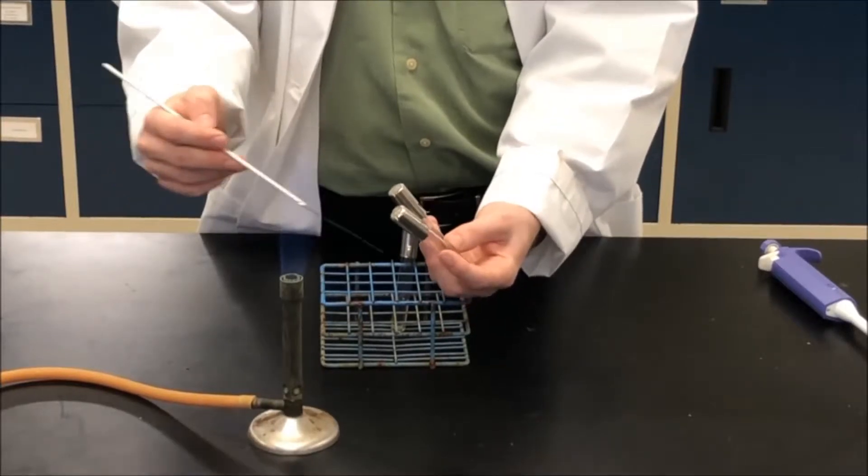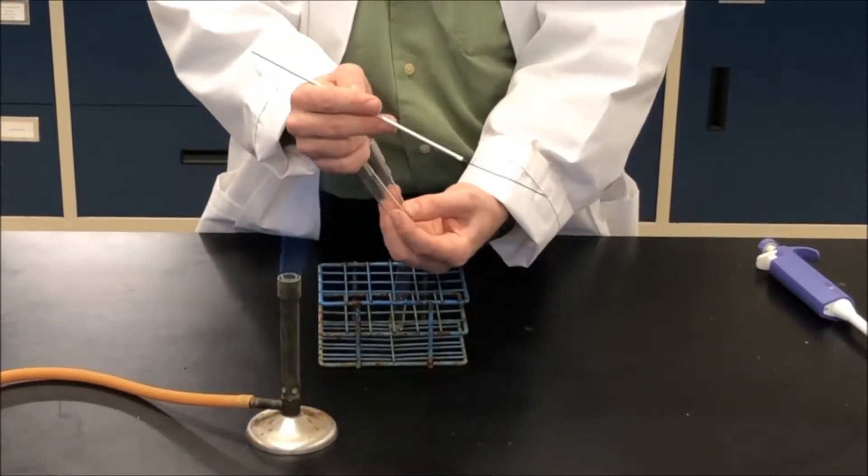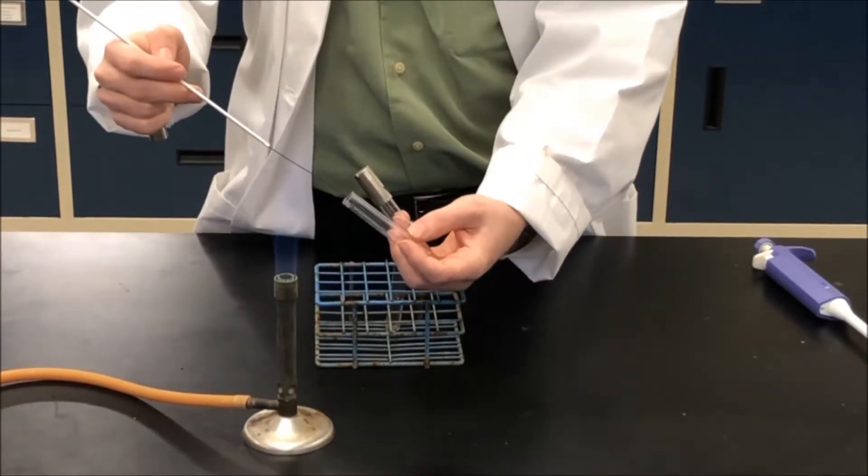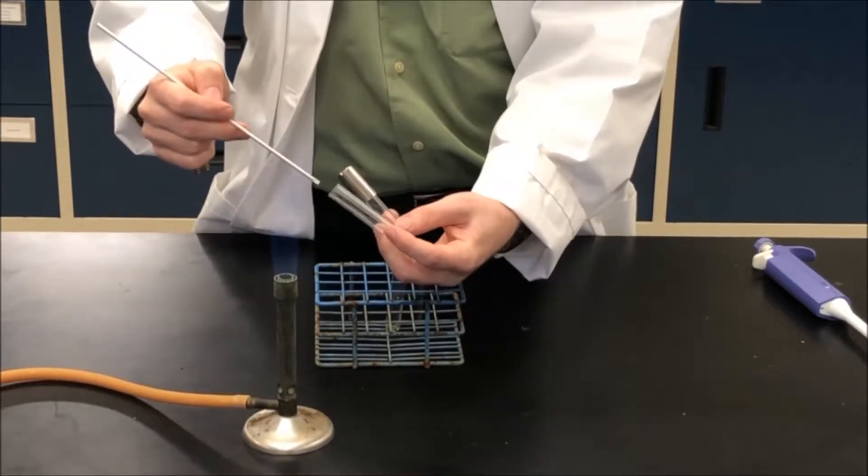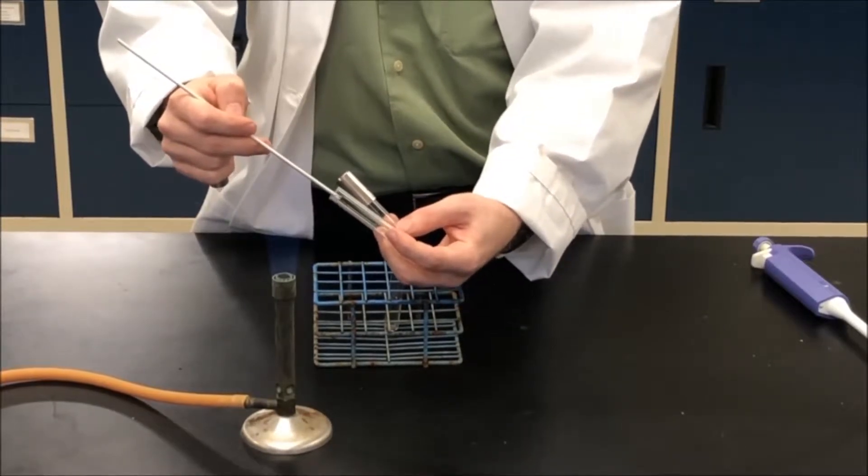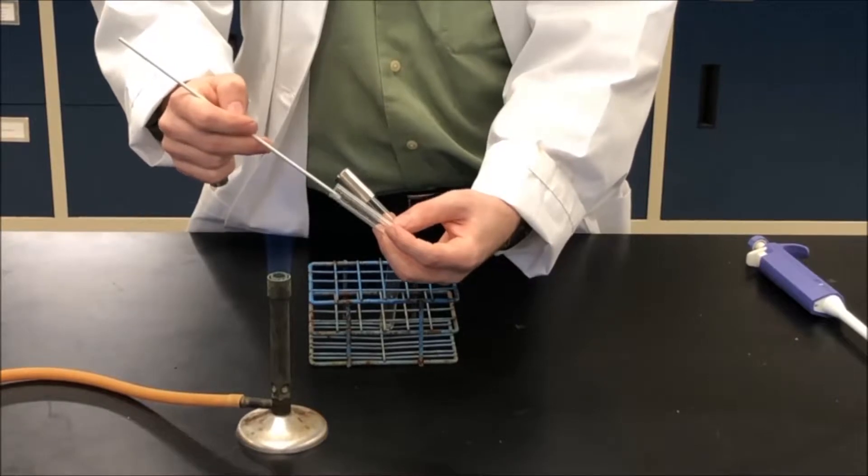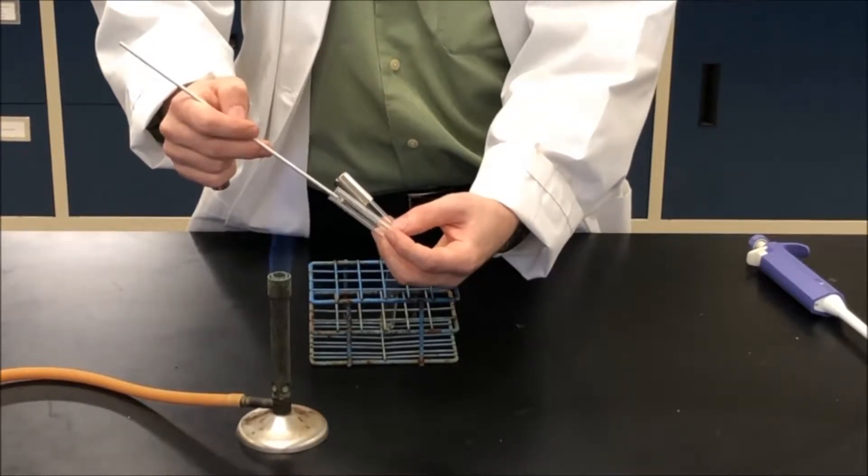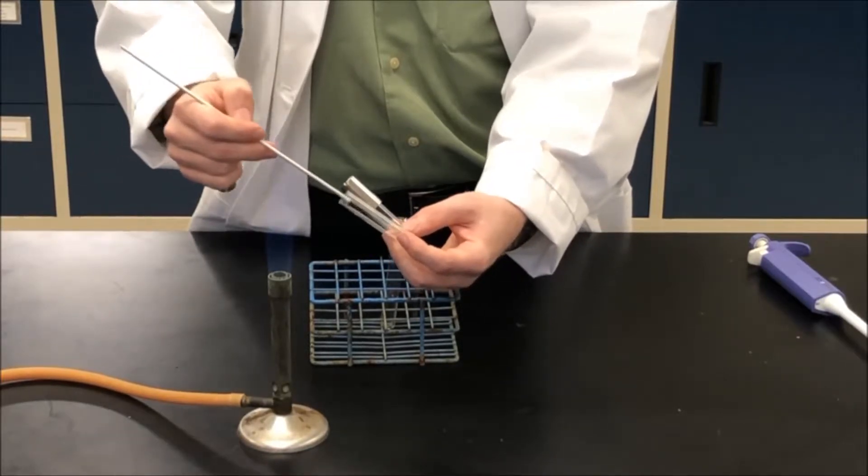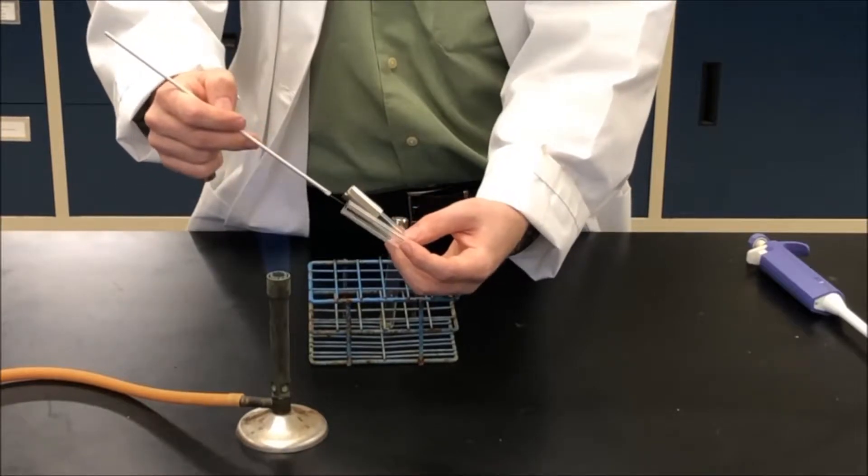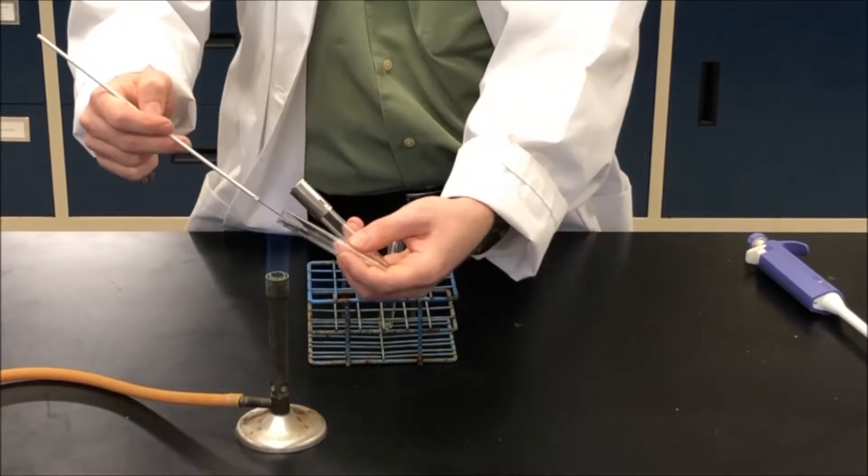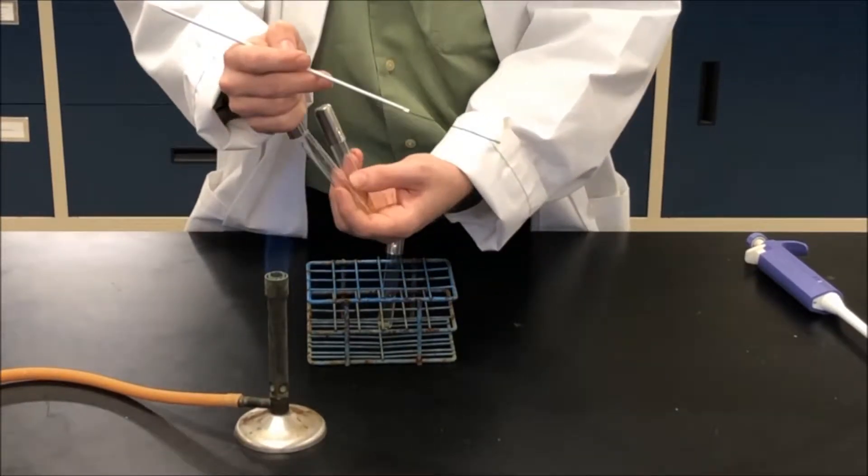Then we start off again. I'm going to open up the culture of bacteria, I'm going to flame the lip, and then I'm going to insert my loop into the broth. If your loop is too hot, you're going to hear some sizzling. That means that you've just killed off some bacteria that's in your culture. That's no problem. All you have to do is just move your inoculating loop up and then go back in.